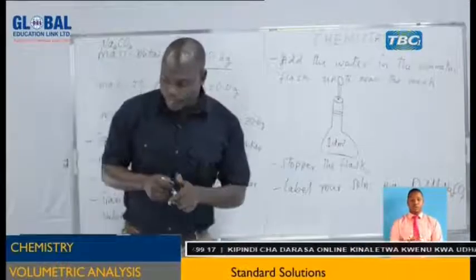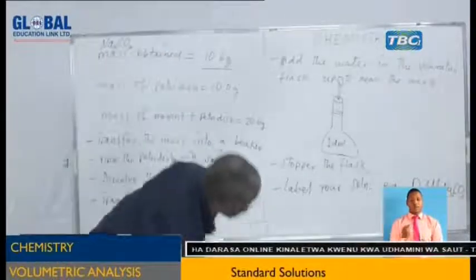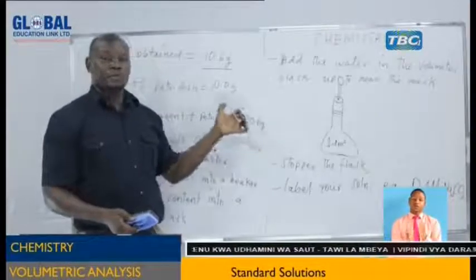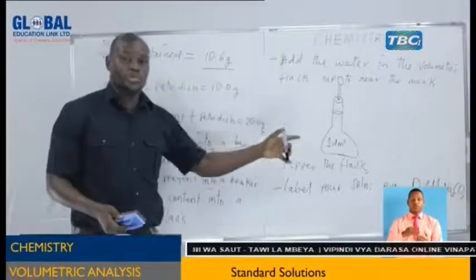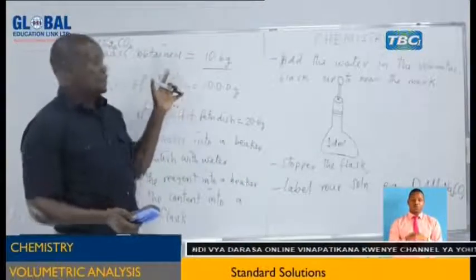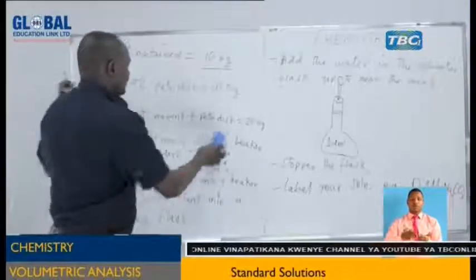Now, my dear students, let us consider how you can prepare the standard solution of those solutions which need to use the standard solution of primary reagents.